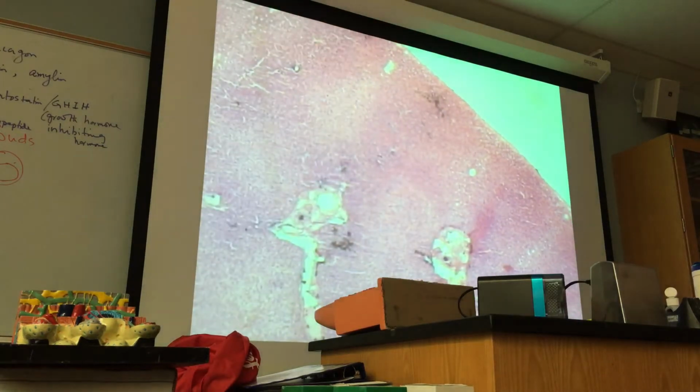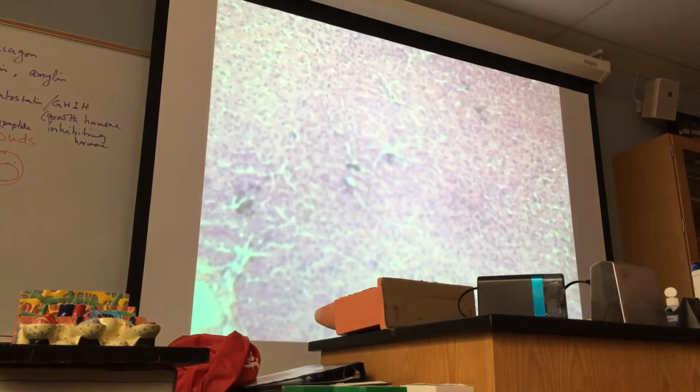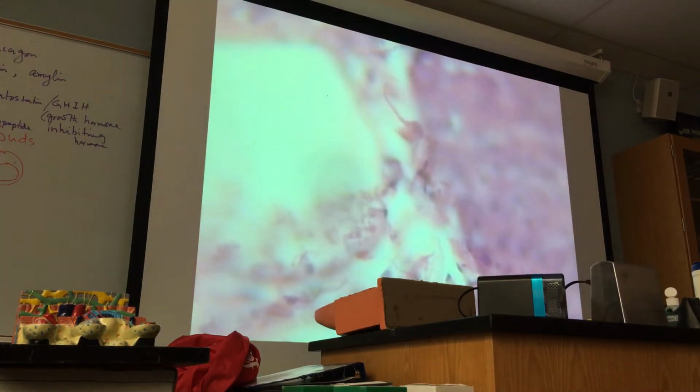Let me get in there. That is present in a corner of the lobule. Look at that. You can even see the red blood cells here. This is the branch of hepatic portal vein that carries blood from small intestine. This is the hepatic artery supplying oxygen-rich blood. And here's the bile duct, and you can see within the lumen of the bile duct is some bile that has been stained black. Let us go to even higher magnification to look at the structure.